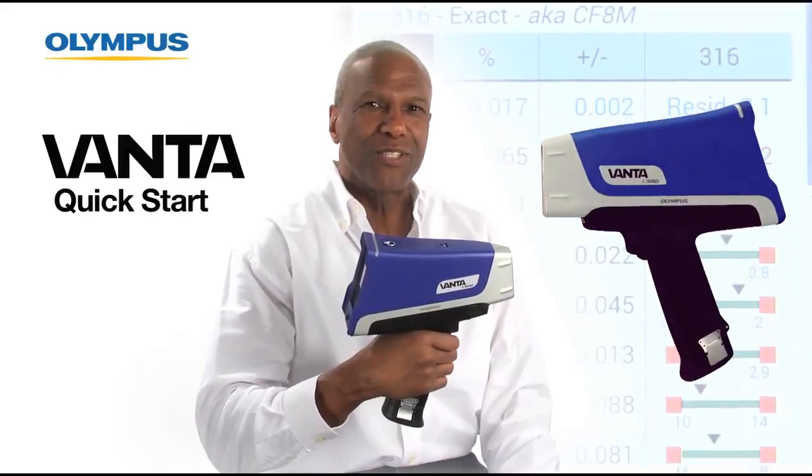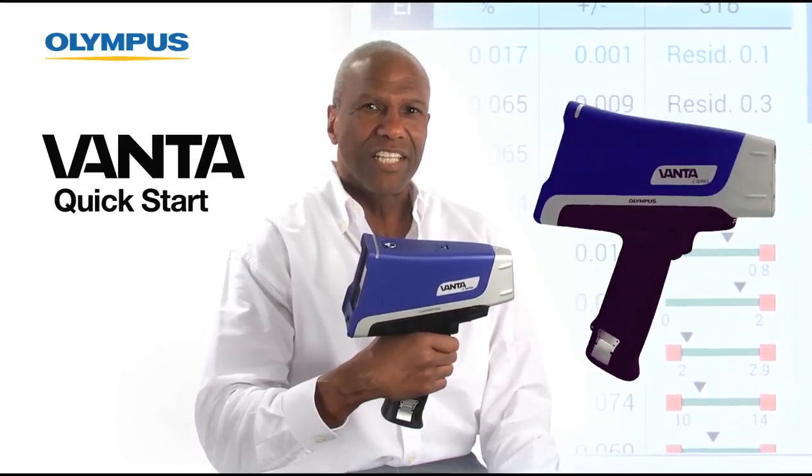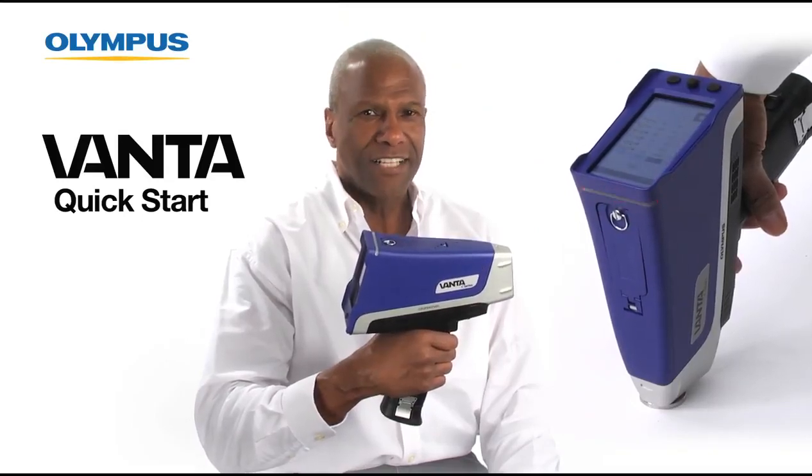Welcome to this quick start video on the new Olympus Vanta handheld XRF Analyzer. In this video you will see how quick and easy it is to use your Vanta Analyzer right out of the case.